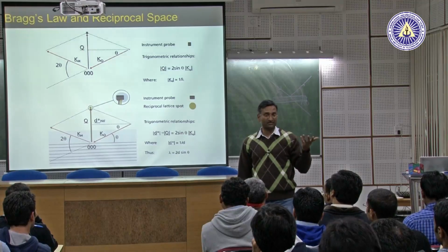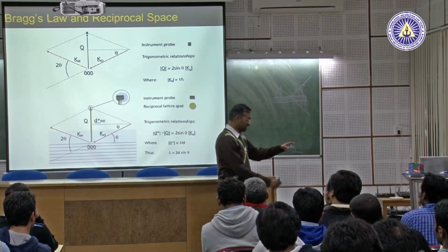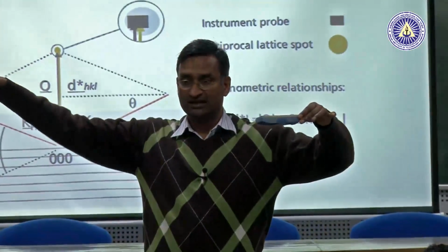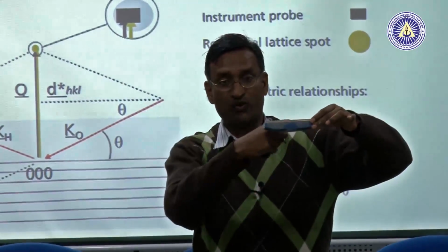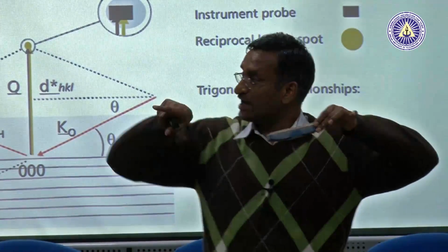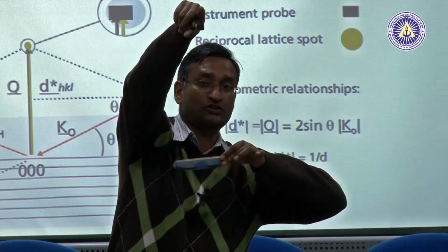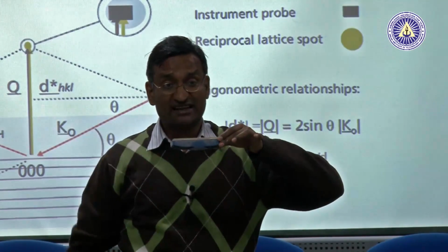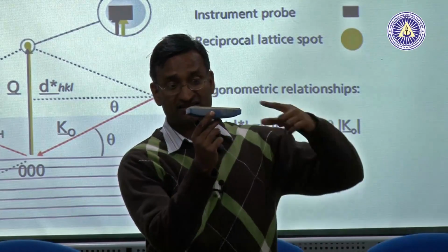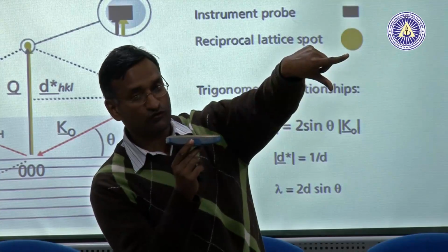You understand by mosaic texture, which means a single crystal would mean that this plane is 1 0 0 all throughout, and the 1 0 0 vector is also the same all throughout. If I measure from this point to that point all the way along the sample, this will always be 1 0 0 and this will always be 0 0 1. Whereas for a mosaic texture, you can have the plane as 0 0 1, but for some grains 1 0 0 will be in this direction, for some other grains the 1 0 0 will be in this direction.